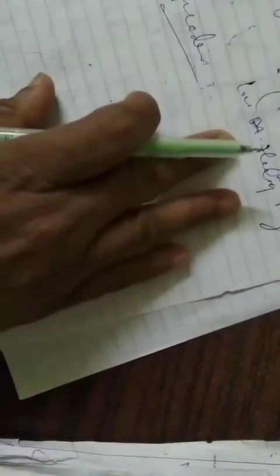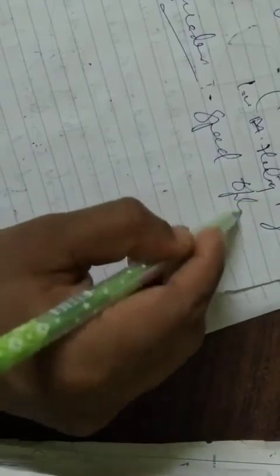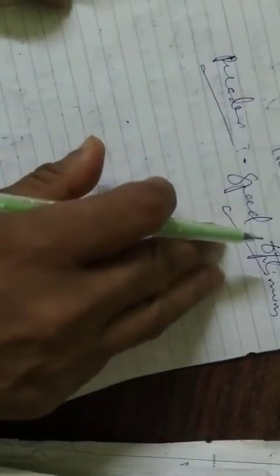Next is the recorder. The recorder speed should be optimum to get beautiful peaks. It should not be kept at a very high speed, otherwise sensitivity will be lost. If you keep the recorder speed at the optimum level, there will definitely be more sensitivity in the recording. And the last one is the environmental factors.